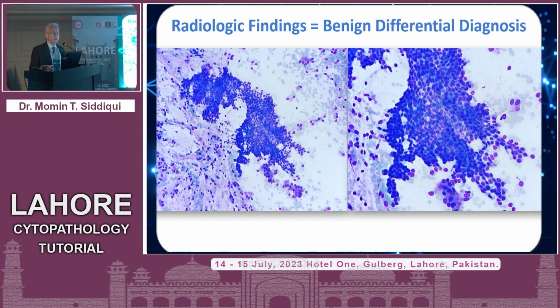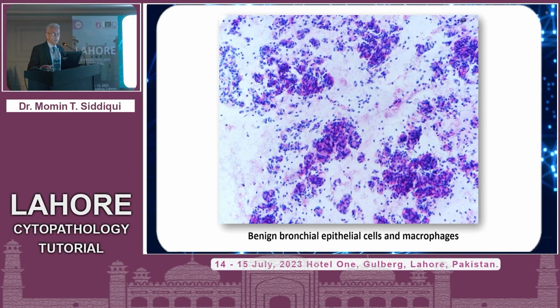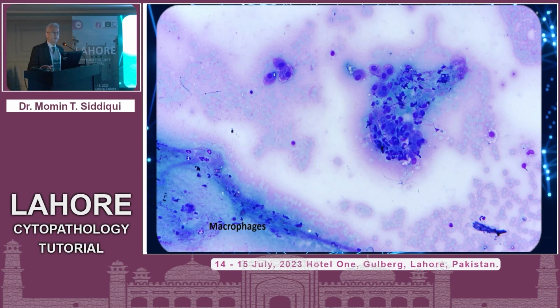So again, these are bronchial cells. Now in this context, it may be a little different, because if the clinical impression is that this is being done for a benign lesion that they want to sample based on the clinical information, this would not be called as non-diagnostic, but may represent lesional tissue. Similarly, macrophages, when noted, can certainly be in the context of pneumonia, be considered as an adequate sample and still be called negative. So this is something that needs to be considered based on the clinical information that you have.